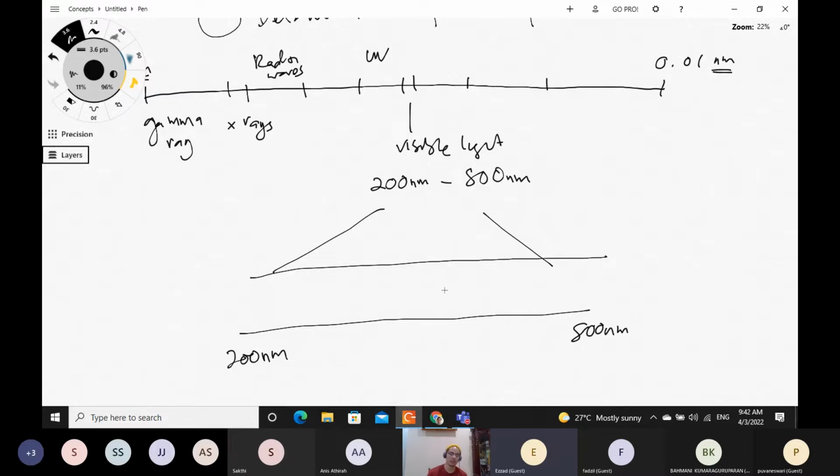So the thing, why am I telling you this? This is because molecules and atoms can absorb and emit. Dia boleh serap dan dia boleh pancarkan balik. Okay, so this is just the behavior of atoms. Okay, the reason why we see colors. Okay, kenapa kita nampak certain colors? It is because objek tu serap cahaya yang lain dan dia pancarkan cahaya tersebut.